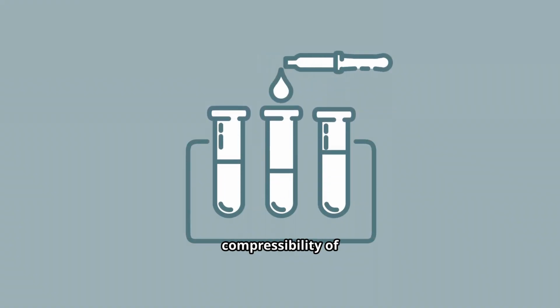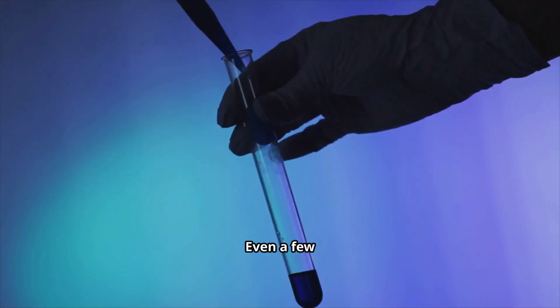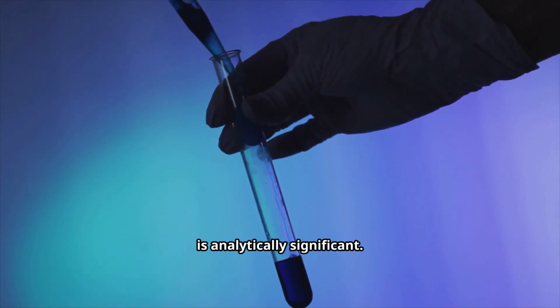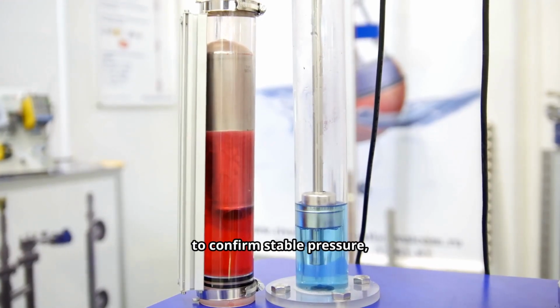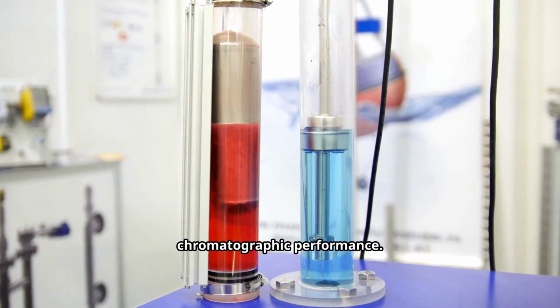Pressure decay can even be quantified. Using the known compressibility of the solvent and the system's internal volume, pressure loss can be converted into an approximate leak rate. Even a few microliters per minute, while invisible, is analytically significant. After any repair, both static and dynamic tests should be repeated, followed by system suitability checks to confirm stable pressure, accurate gradients, and consistent chromatographic performance.